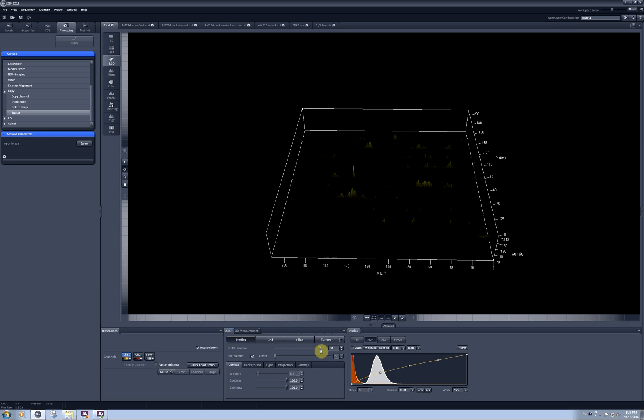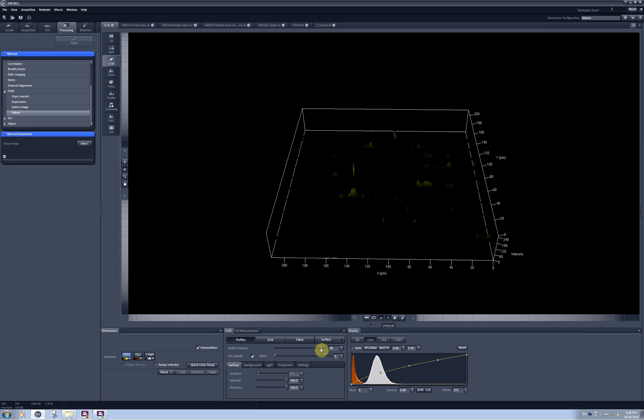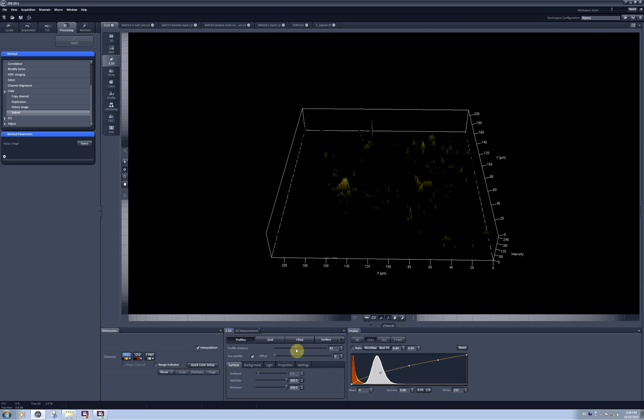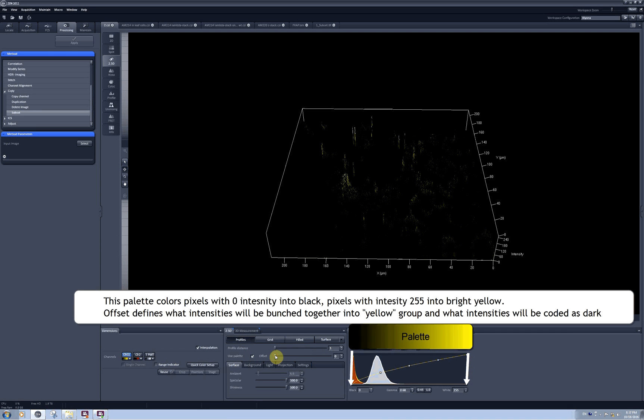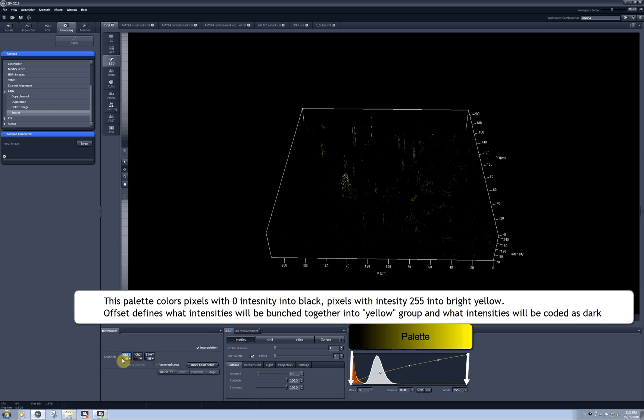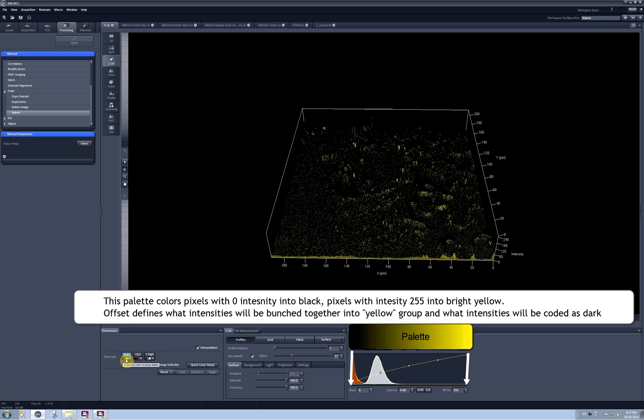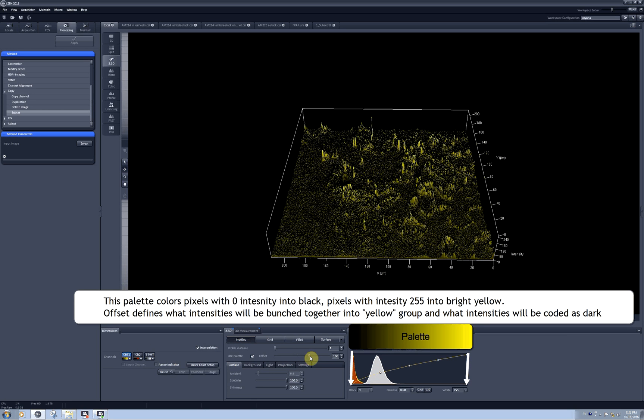It decreases the amount of information, but it might be easier to understand what is going on in your image as well. You can set the offset for the palette. In this case it's palette color coding the channel from dark gray or black to bright yellow. So I can change the position of this gradient on the palette by tweaking this offset.